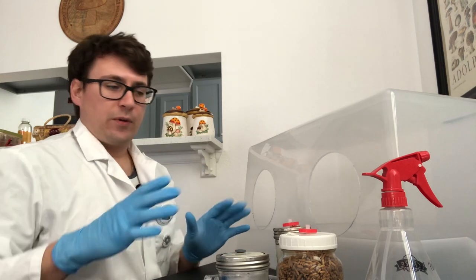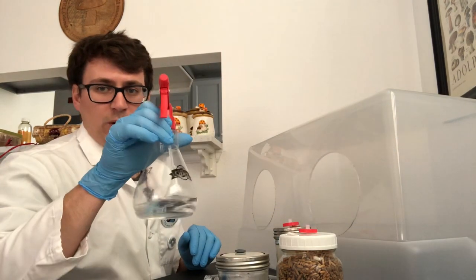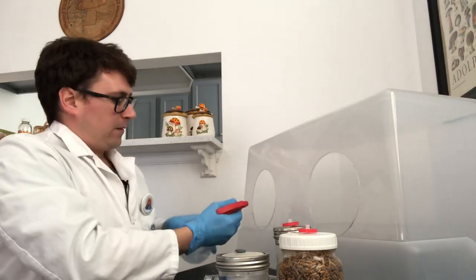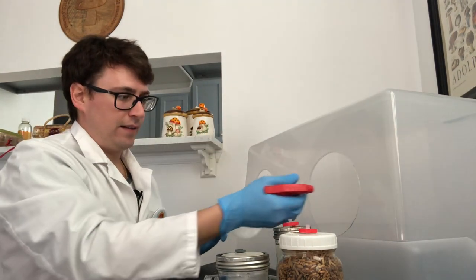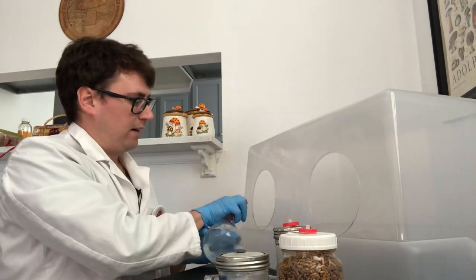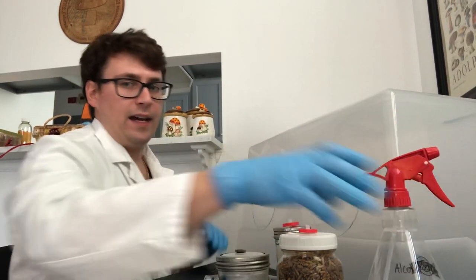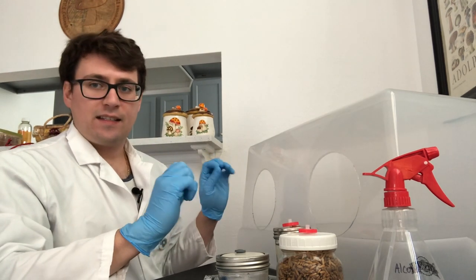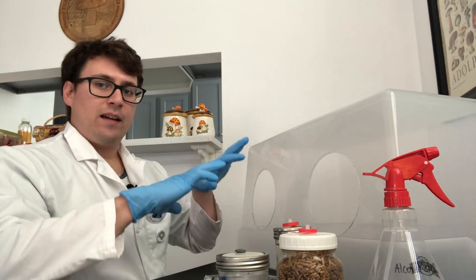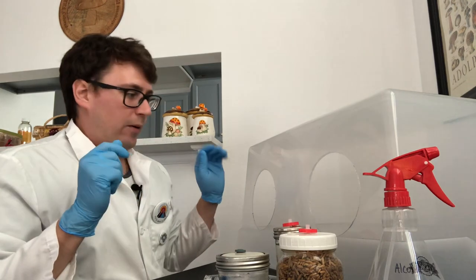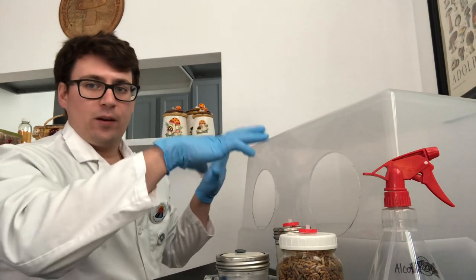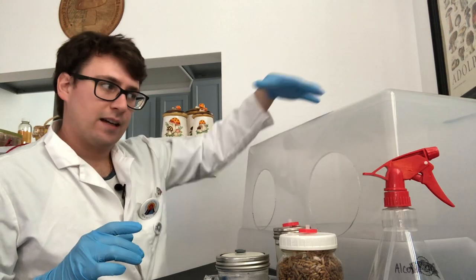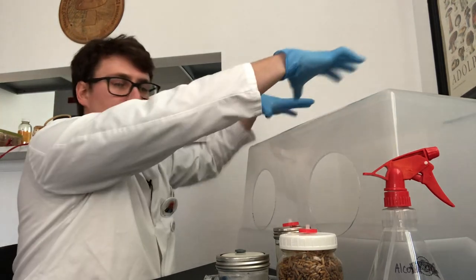One way to prevent this is to use isopropyl alcohol. I'll just spray my hands off and you want to spray off the inside of the still air box and let that alcohol evaporate. As it evaporates it's degrading the lipids and any bacteria and it will kill any living organisms on that surface. Right now it's disinfecting this cube of air space.